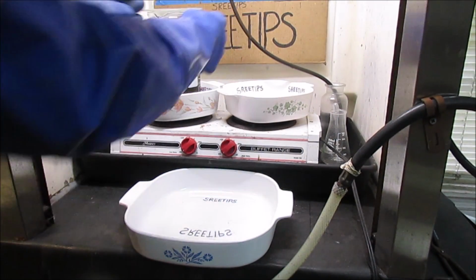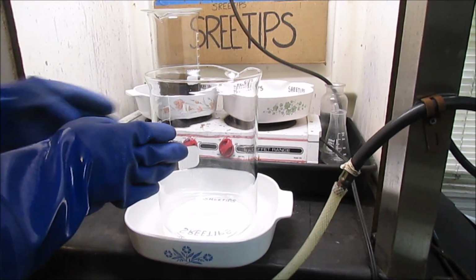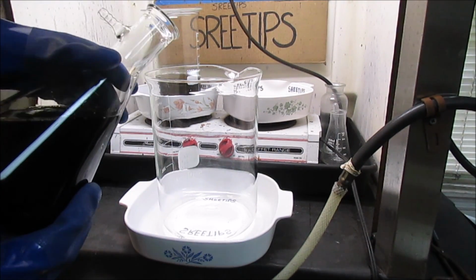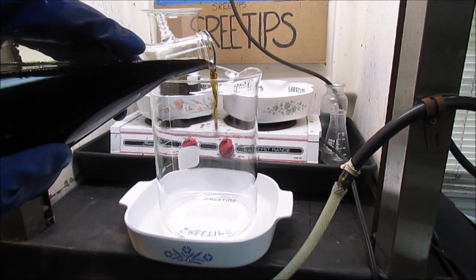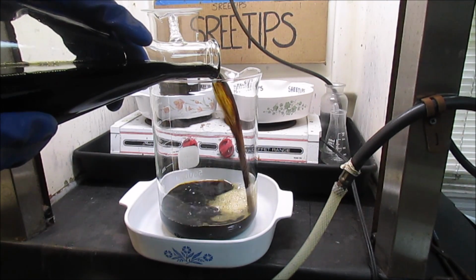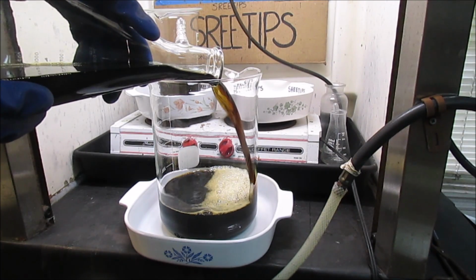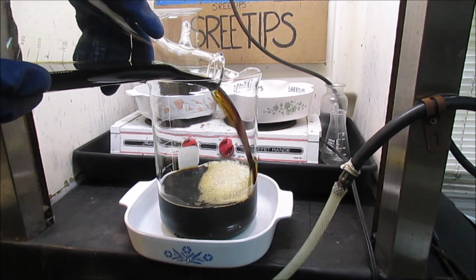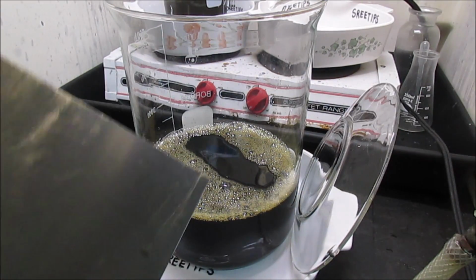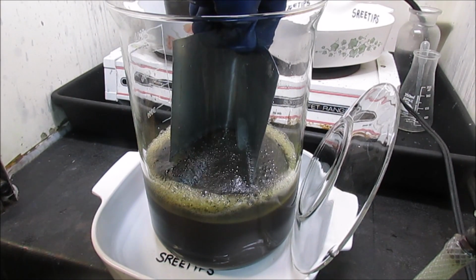While waiting for that gold to settle, I decided to pour the platinum solution into this large 5-liter beaker. And what I'm going to do is, once I get that solution in the beaker, I'm going to be adding some pieces of pure zinc metal to it. And what will happen is, in accordance with the reactivity series of metals, zinc being higher up in the list and therefore more reactive, will displace the platinum group metals that are dissolved in that acidic solution there.